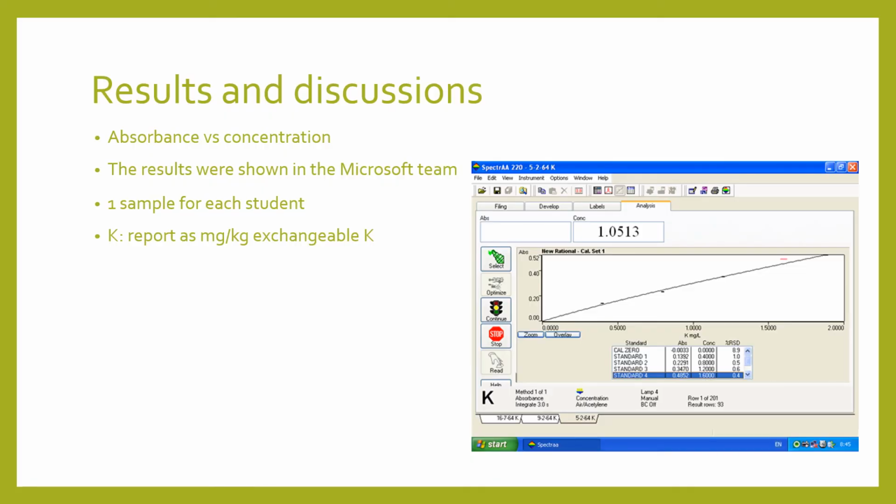After reading the sample, we will get the standard curve, and we have the linear equation, and we can calculate the concentration of the solution.